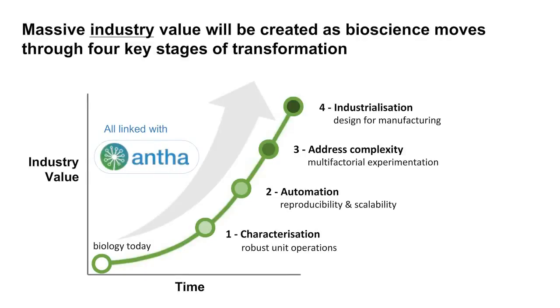For us, it starts by a robust characterization of our inherent lab practices. If you don't have reliable working practices, if you can't transform your cell lines, if you can't effectively make genetic interventions, if your assays have poor signal to noise, well, you basically cannot draw definitive conclusions. Also, if your fundamental lab practices are unsound, automation is a problem. It's not an asset. If only 25% of your constructs are successfully assembled and you now try to make thousands using automation, well, then you've just created hundreds of problems for yourself.